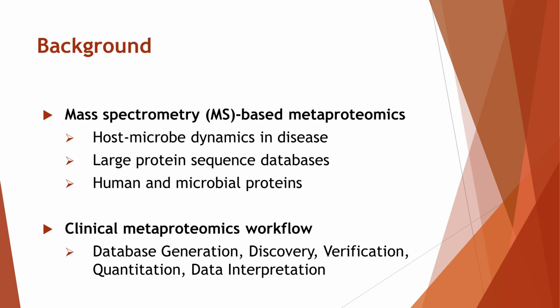Before we get too far along into the tutorial, I do want to make an important note. To demonstrate this workflow, we will analyze a small example set of quantitative proteomics data from an ongoing study of ovarian cancer in fluid from cervical swabs. This demonstration is meant to highlight the methodology and its effectiveness.